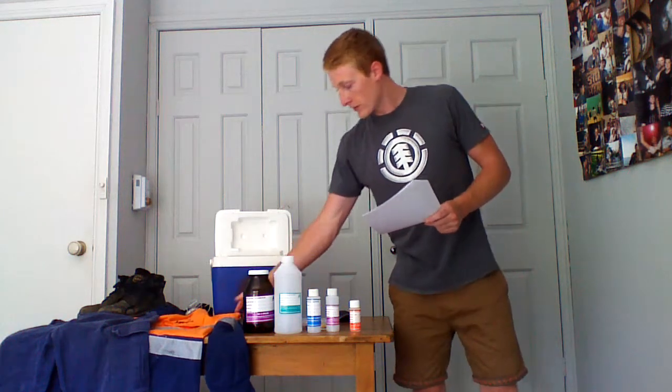So if we have a look at the PPE, field techs will require to use disposable gloves to help protect for bottle preservatives, eyewear also, lace up steel cap boots for prevention of slipping over, and long pants and long sleeve shirt. Okay, very common in most mine sites and industrial sites.